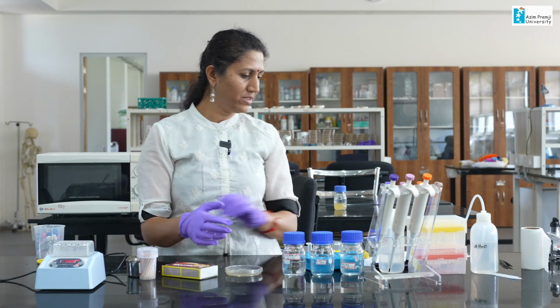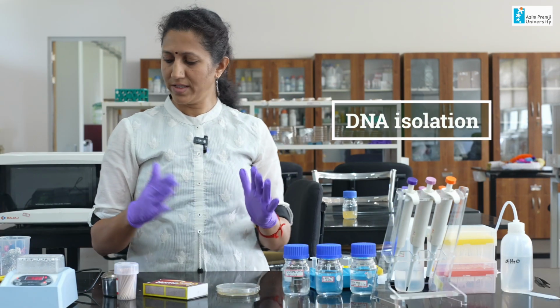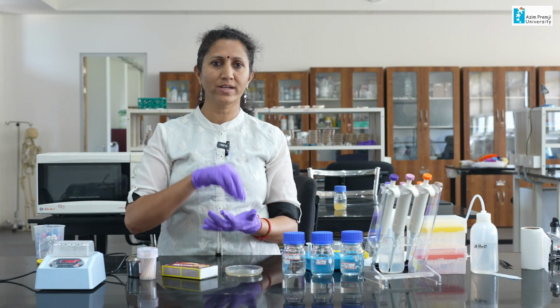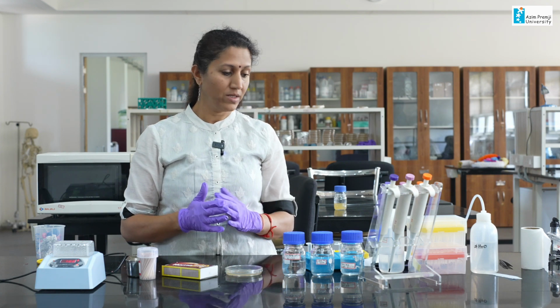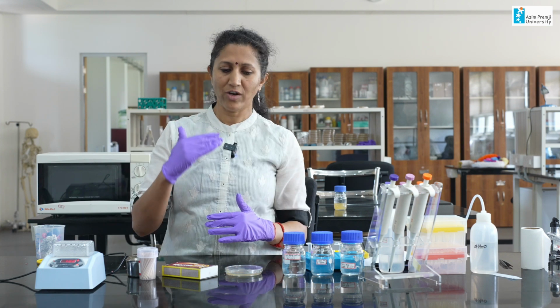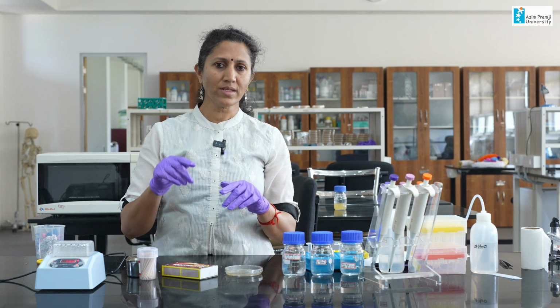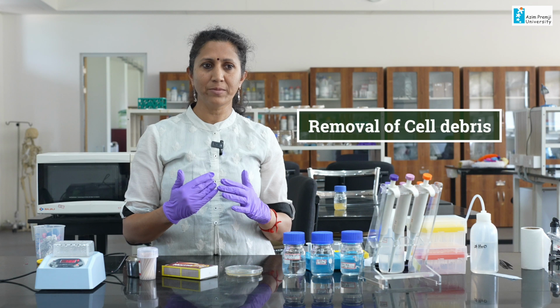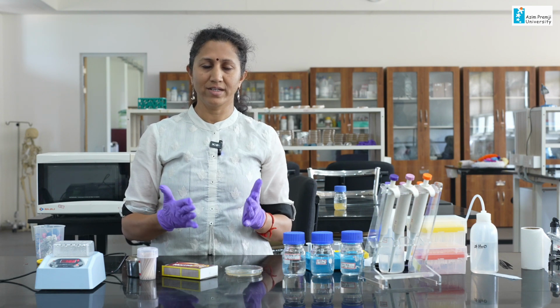As I mentioned, the DNA extraction process involves removing unwanted things from the cells, like the cell membrane and the protein content inside, to get pure DNA. Any DNA extraction process involves the following steps. The first step is lysing the cell membrane, using chemicals required to break it down. The second step is removal of unwanted proteins and cell debris, where you use proteinase enzymes, and RNase, an enzyme which removes the RNA content.